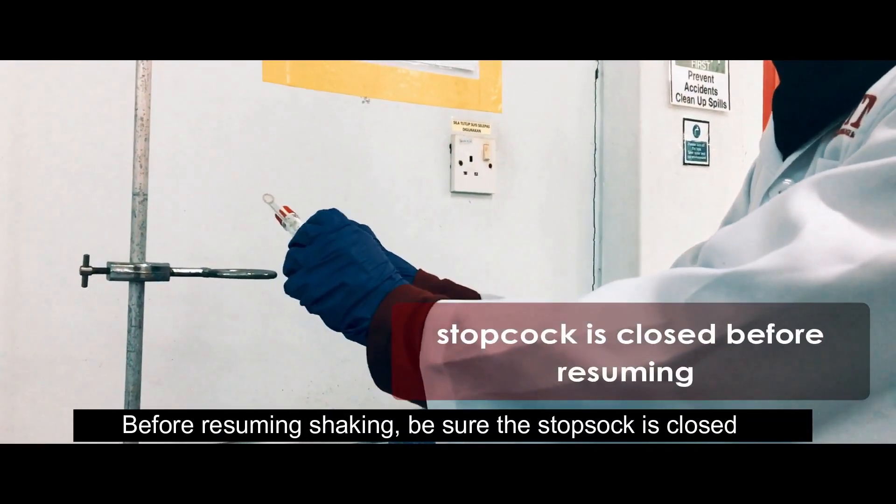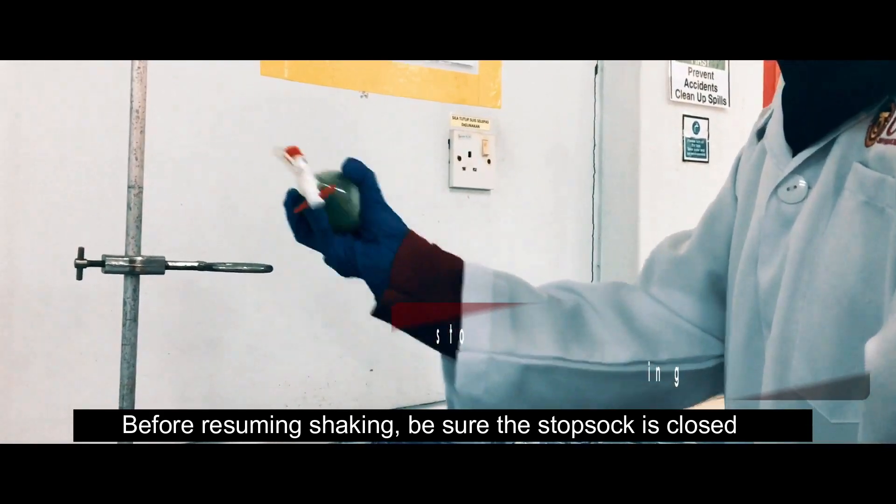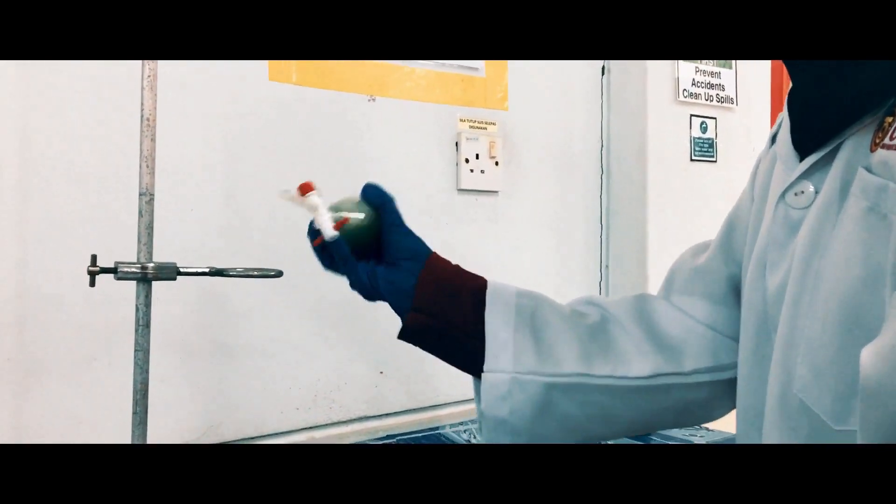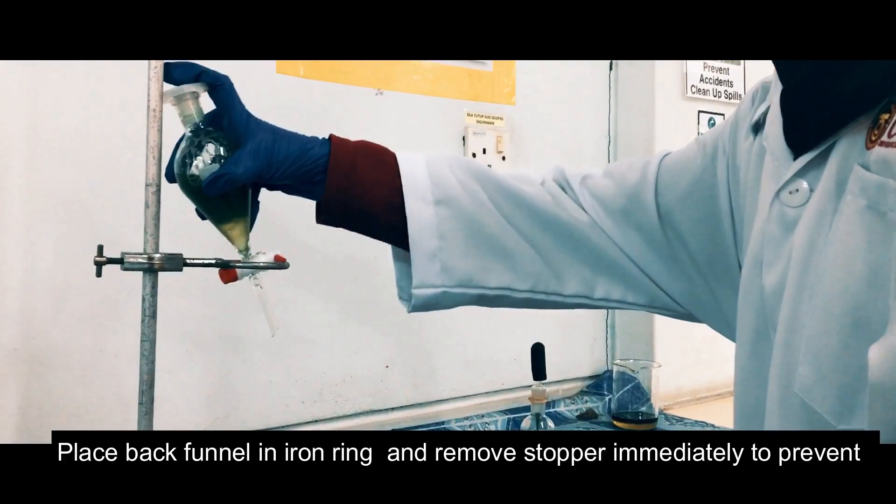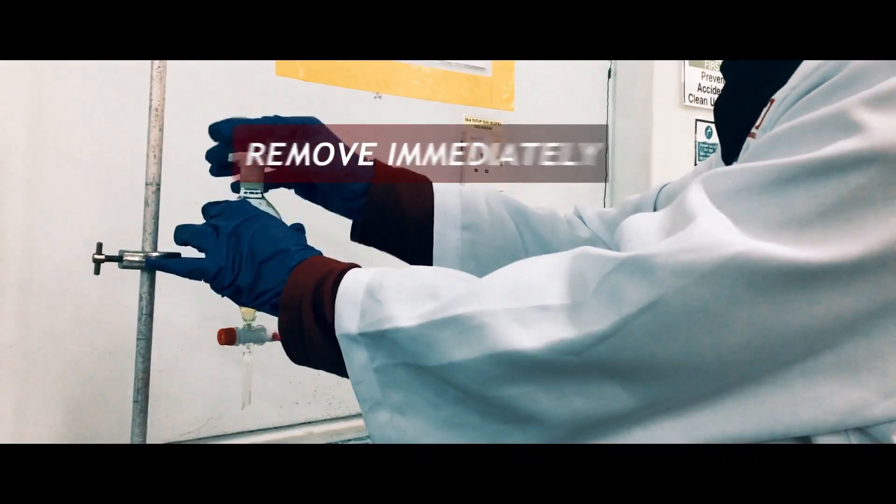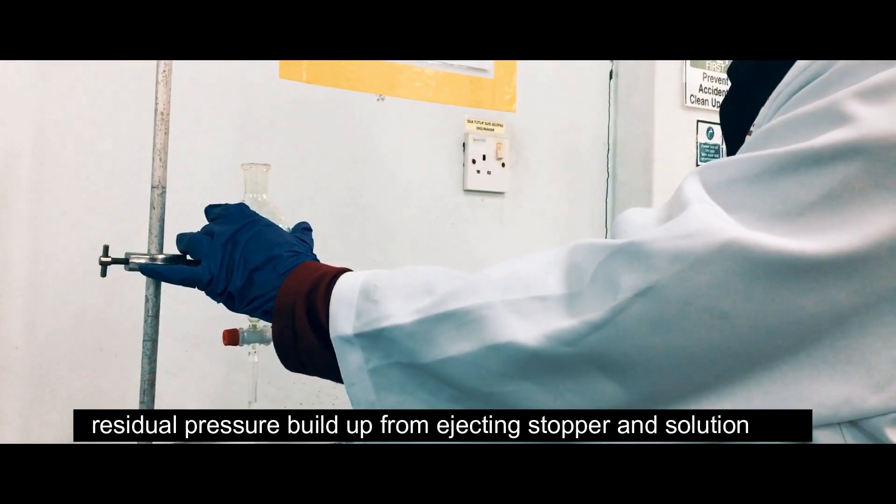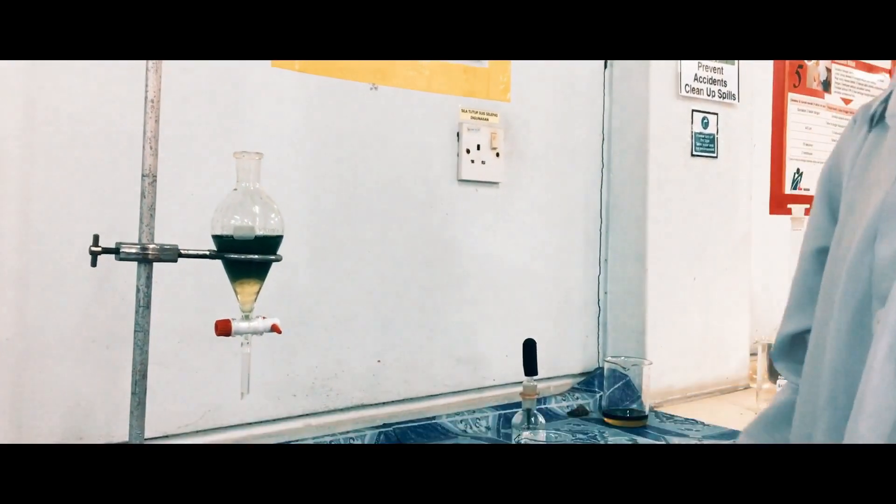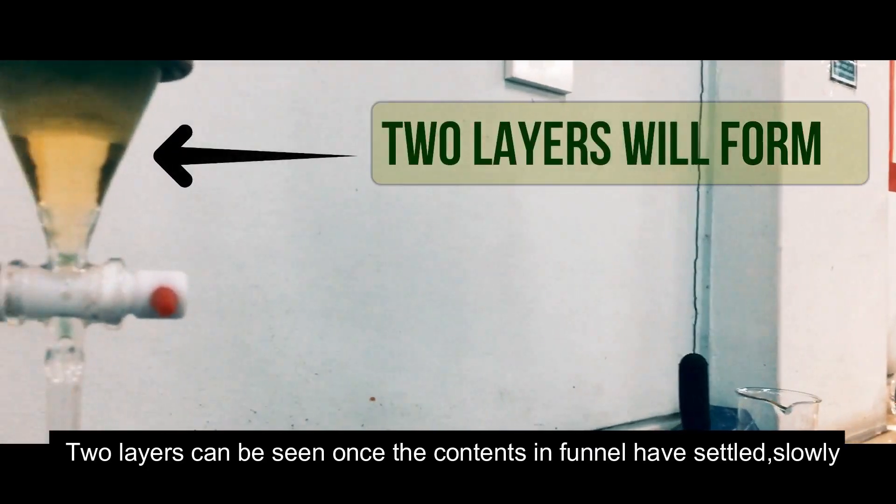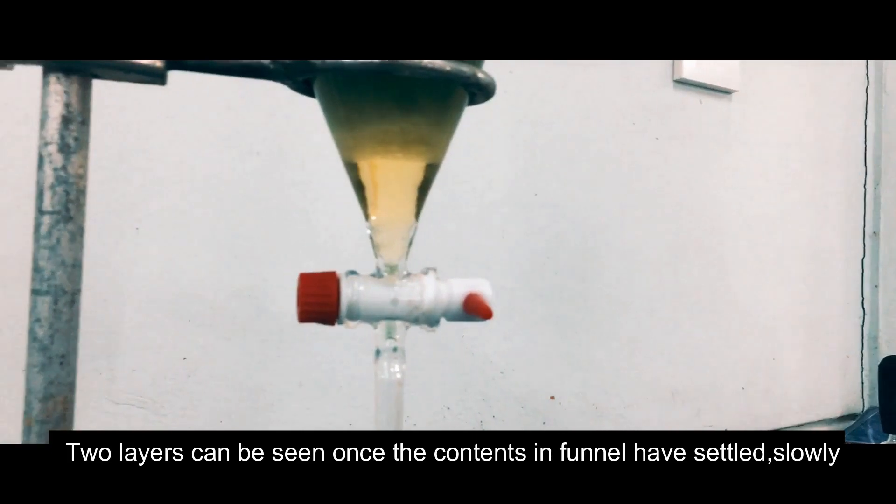Before resuming shaking, be sure the stopcock is closed. Place back funnel in iron ring and remove stopper immediately to prevent residual pressure build up from ejecting stopper and solution. Two layers can be seen once the content in funnel has settled.